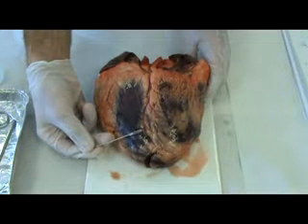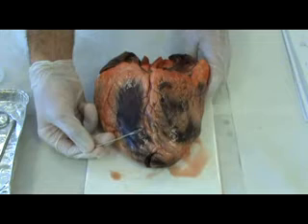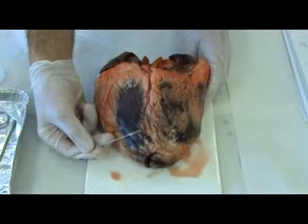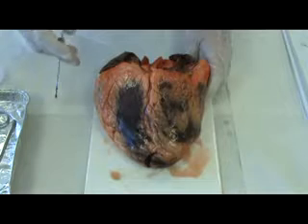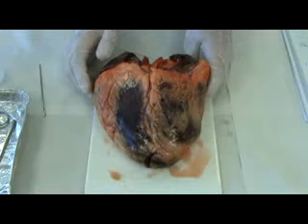It's very thin, but tough and flexible. It is a serous membrane, and it's important to reduce friction. Certainly the heart will be moving when it beats, and if we limit the friction within the pericardial cavity, the heart won't suffer any ill effects.